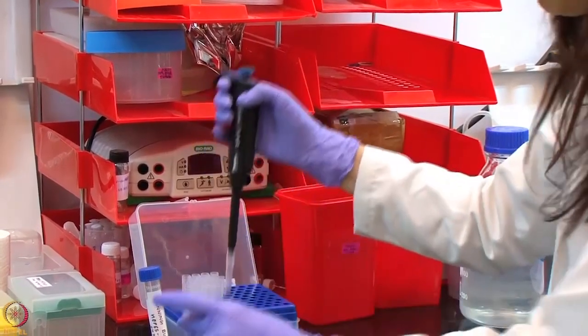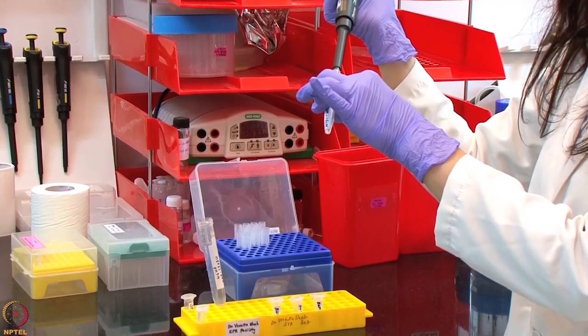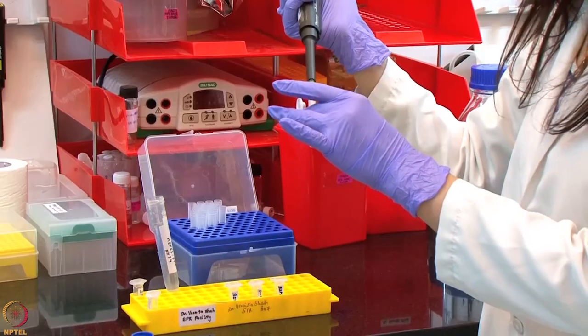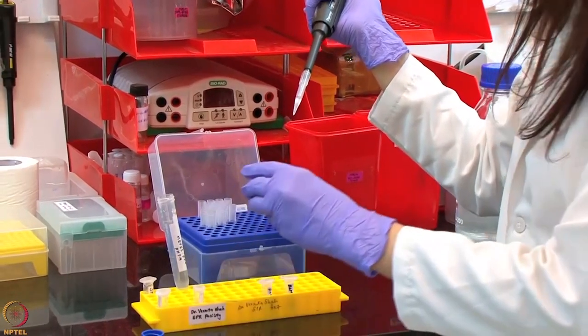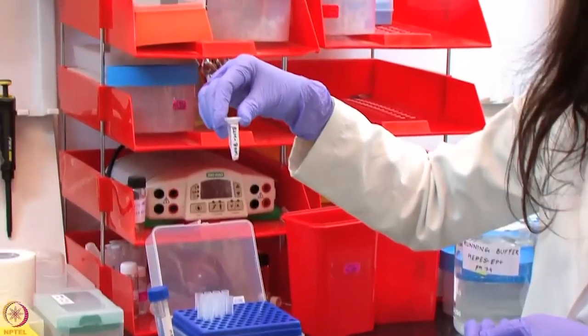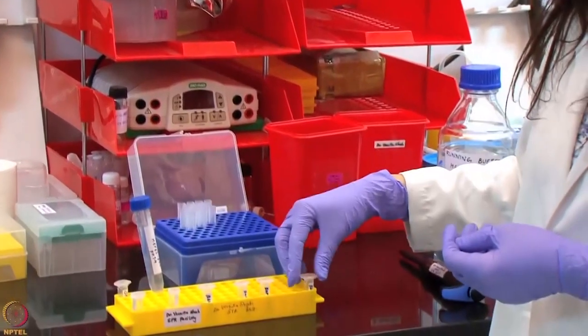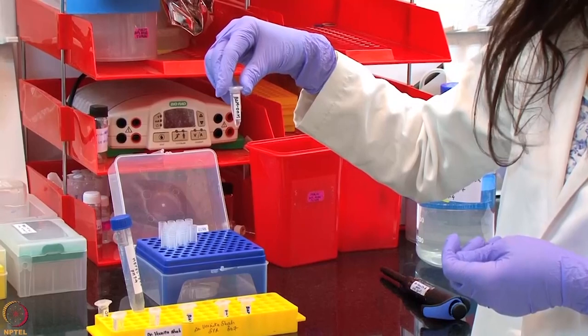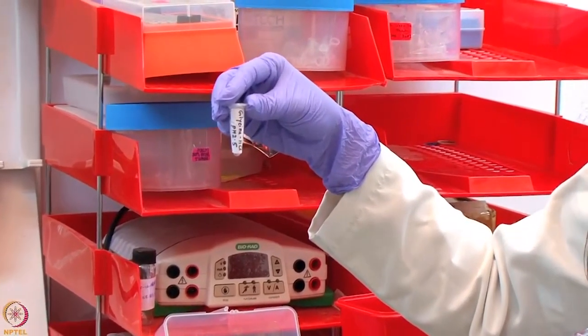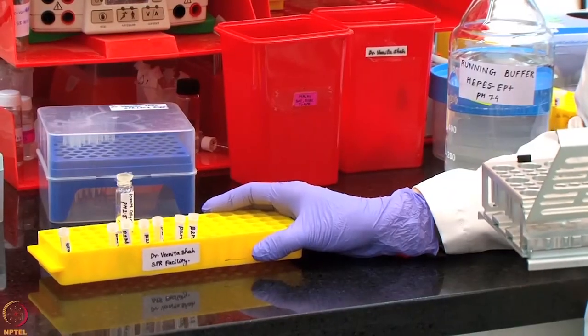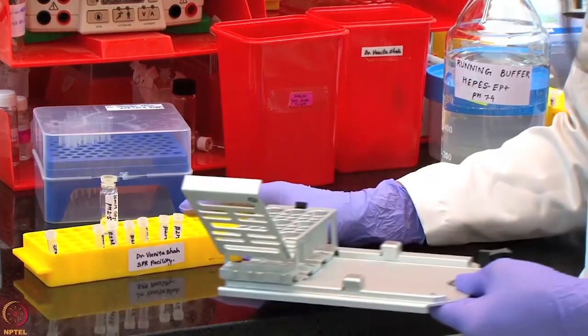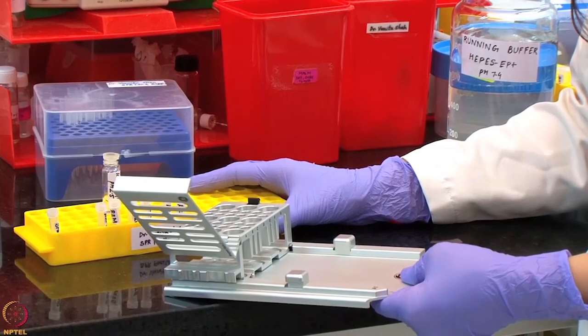We similarly continue with the dilution series for rest of the concentrations. One of the concentrations, that is 8 nanomolar, will be run in duplicate and we will also include a 0 nanomolar concentration in the experiment. For regeneration, we will be using glycine HCl pH 2.5 as the regeneration solution. All these samples and reagents have been transferred in the required volume in these specialized tubes and will now be inserted in the appropriate rack and then into the system for the kinetic interaction analysis.